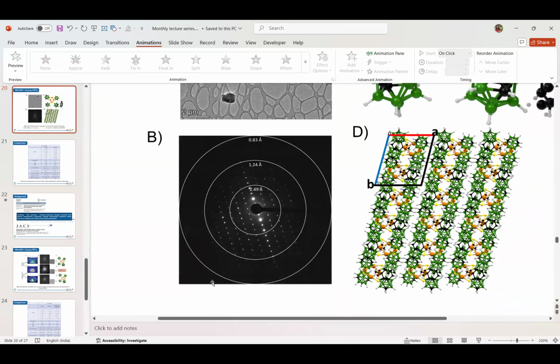If you pointed it out, it's like a reciprocal lattice. She was talking about the Ewald sphere and all these things. It's the reciprocal lattice that you are seeing. The largest distance, like 0.83, is the closest atom to the center atom. You understood? The Ewald sphere works like the reciprocal lattice. The farthest distance spot is the nearest atom.